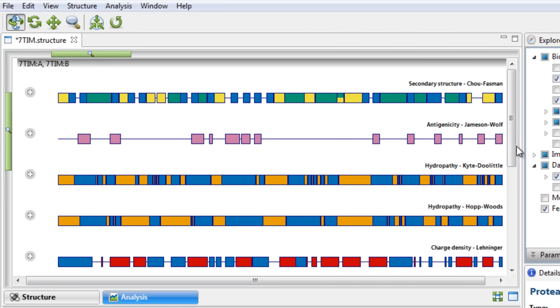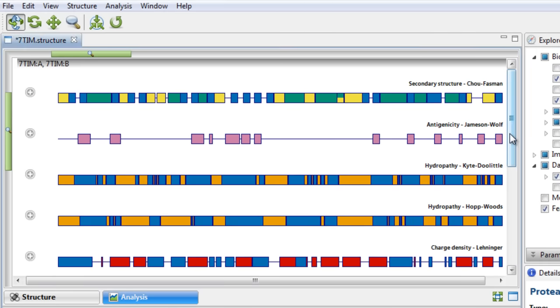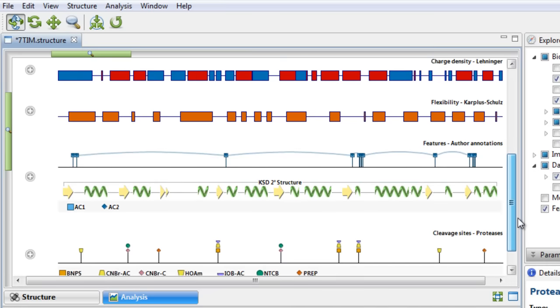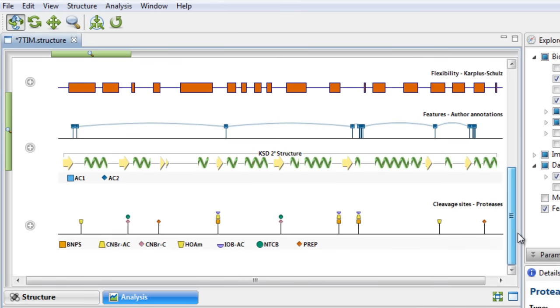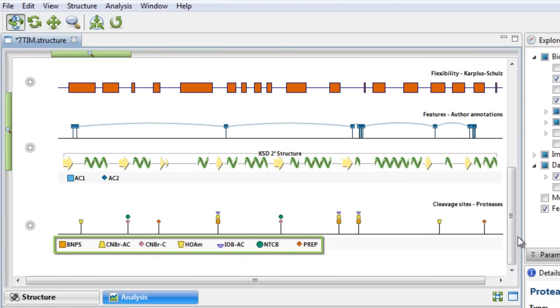The method will now be applied to the Analysis view and displays matches to protease and chemical cleavage sites. The legend below the cleavage site synopsis identifies the proteases.